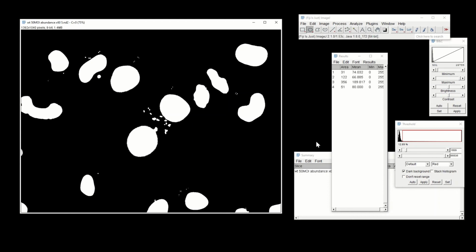Now, you don't want to quantify anything that's below about 5 pixels square in size, because that's typically just noise. But now we also don't want to quantify these large things, right? And so remember that we can measure them to kind of estimate how big they are. So 17,000, maybe this one is smaller, and maybe this one is a bit smaller. So I would say that you can quantify everything from maybe 5 or 7 pixels up to maybe 1000 pixels in size, and this will give you a fairly decent estimate of how many of these smaller objects you have.